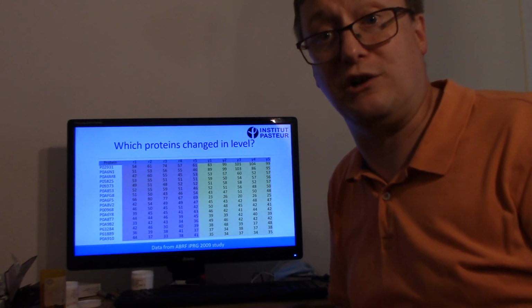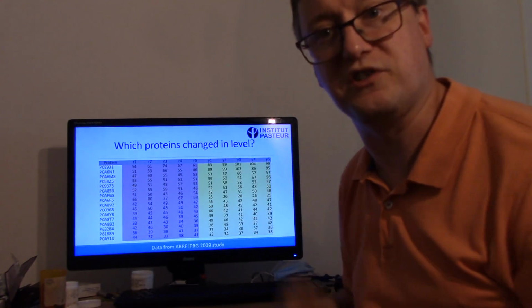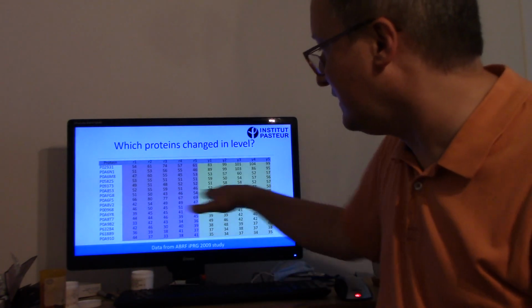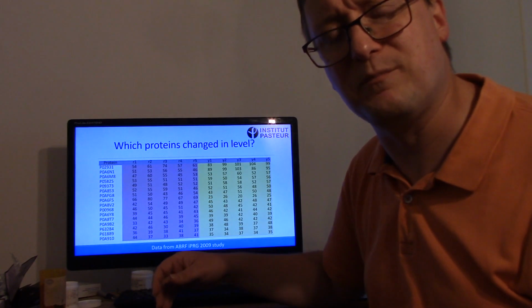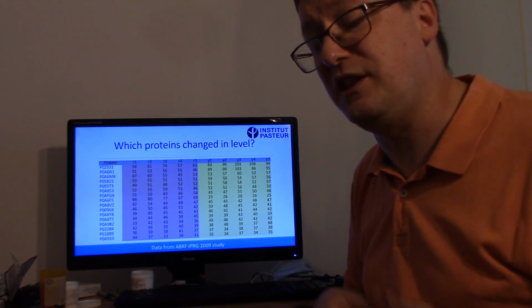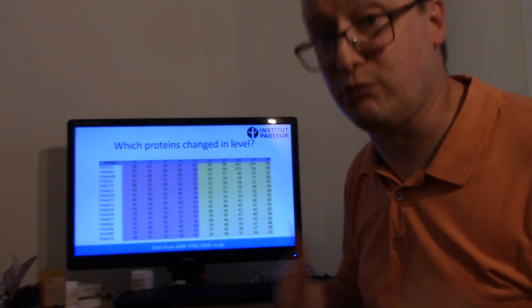What you're performing there is called a U-test, to evaluate the range of values from one cohort versus the range of values in the other. And you could get a significant p-value for this protein under those circumstances. But data like these illustrate that there's quite a lot of bounce we see in these numbers. If there's variation in the number of spectra we see for a protein across technical replicates, think about how much worse this gets when we're dealing with biologically different replicates rather than just technically reshooting the same sample.